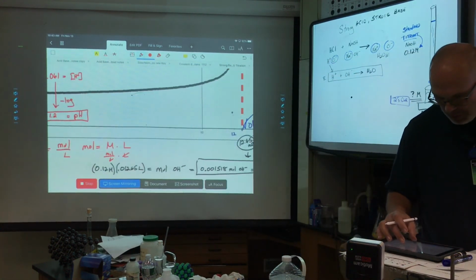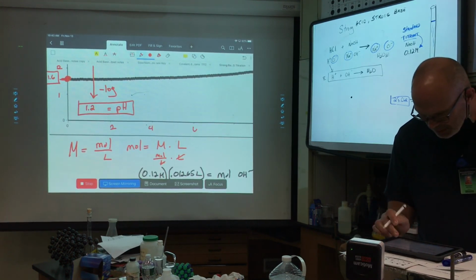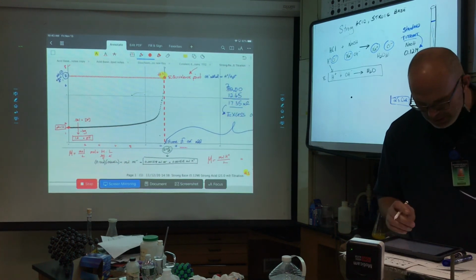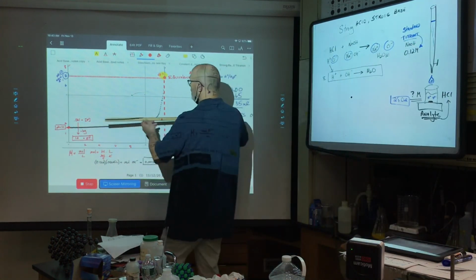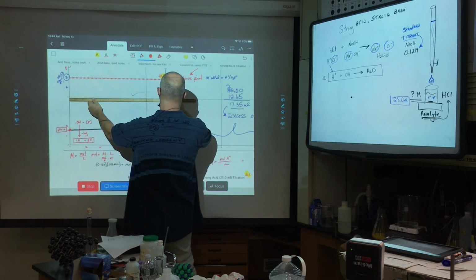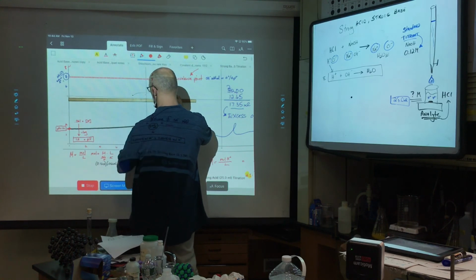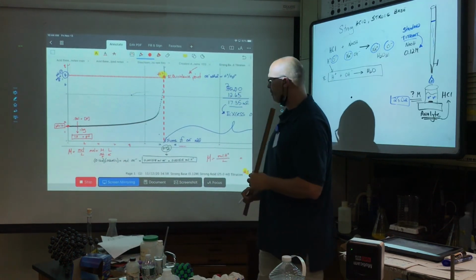6.325 somewhere, and of course we're estimating this, okay? So this is 2, 4, 6, this is 8. So we could probably measure it out. You can also measure it out if I'm using my ruler, okay? Right here is, I could probably do this. Let's use English units. And so I'm getting about 7.6, so 4.55, and drew that straight down, something like that. 2, 4, 6, 8, yeah.